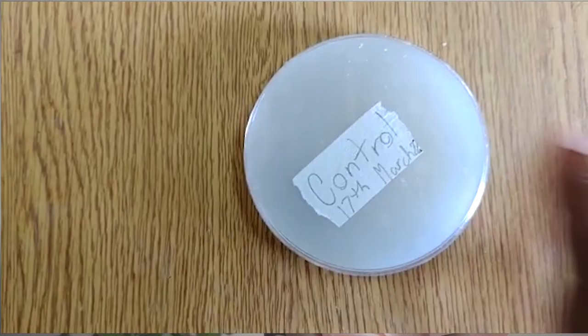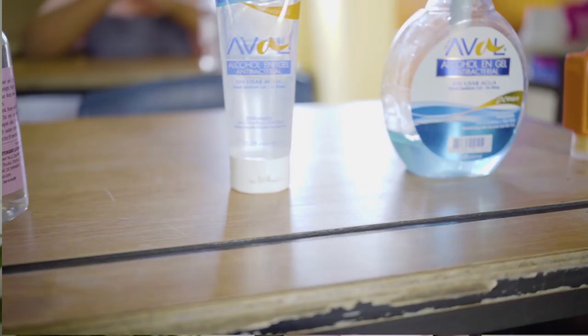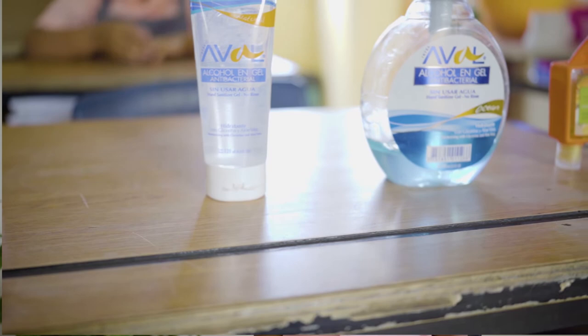The control plates had no bacterial growth. The three sanitized plates that did not produce much bacterial growth as the others were from the Aval Gel Sanitizer and the Blue Caribbean Spray. The Aval Gel had 62% alcohol and the Blue Caribbean Spray had 76% alcohol, and it had the least amount of bacterial growth.